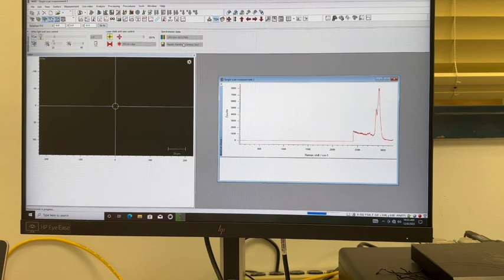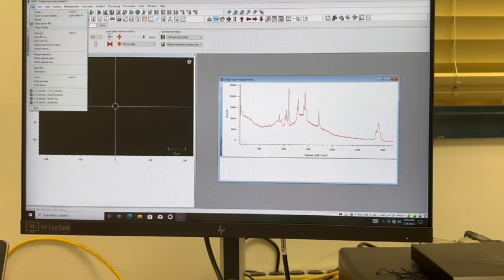As you can see in the spectra, it is much cleaner and there is significantly less noise than in the prior readings with lower laser powers. This spectra has clear peaks. Now that we have gotten a clear measurement with defined peaks and little to no noise, we will save this measurement.